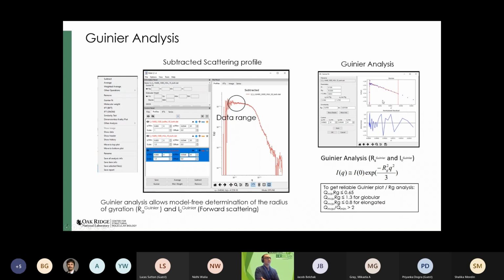Basically, what you expect for a good linear fit is a straight line. When you have that kind of good data, the residual of the fitting is randomly distributed across the zero line on the normalized residual plot.